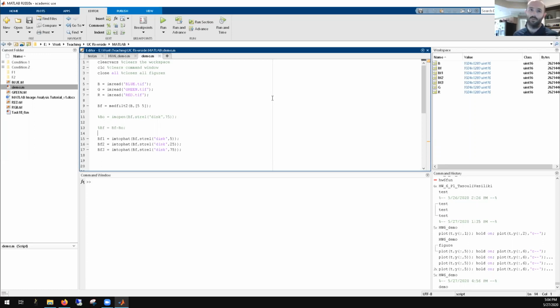There's other filters as well, low pass filters, high pass filters. We can look at things that are in the frequency domain, things that are in the spatial domain. There's pros and cons of these different filters. But before we get too in the weeds on any one subject, I want to try to connect everything all together. So a lot of times we're interested in quantifying specific things.